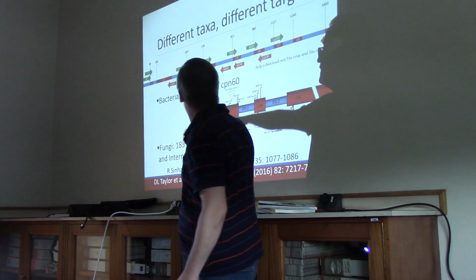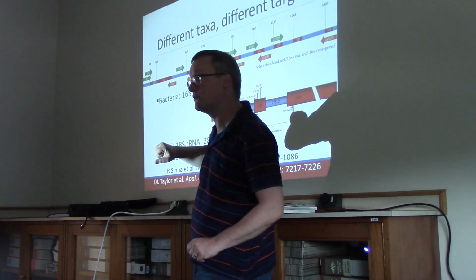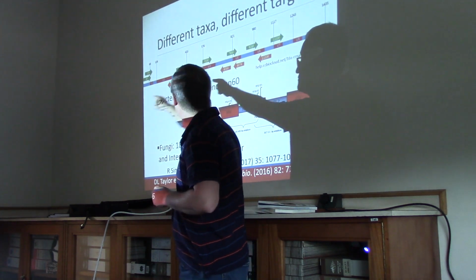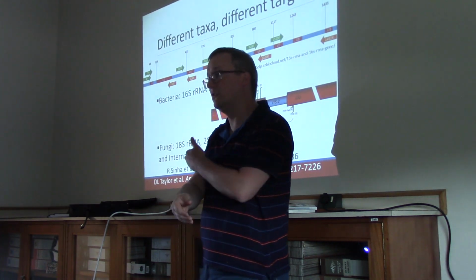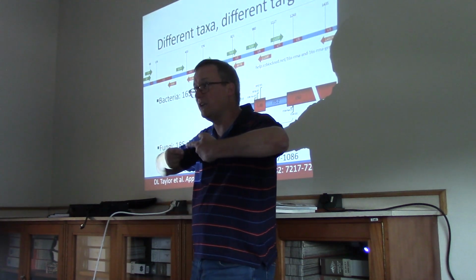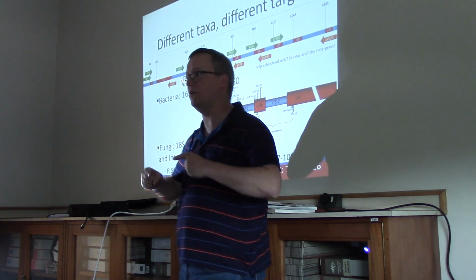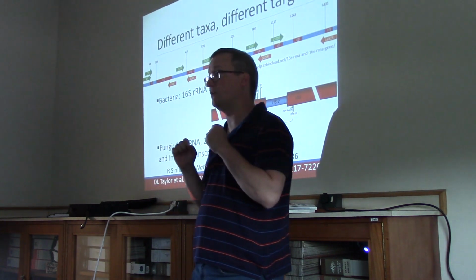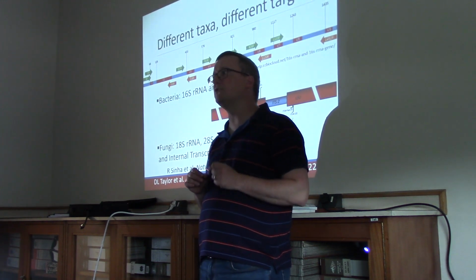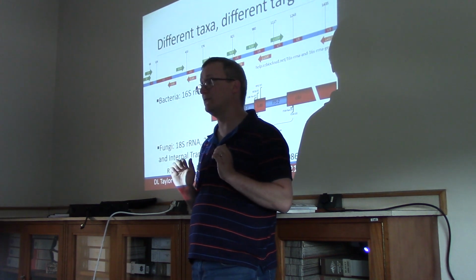So we then think of creating forward primers, here shown as green arrows, sitting down in constant regions, and reverse primers that are sitting down in constant regions. But we want them to be flanking a V1 sequence, or flanking a V2 sequence, or flanking a V3 sequence. How is it going to alter matters if we're using a sequencer that produces long reads rather than short ones?